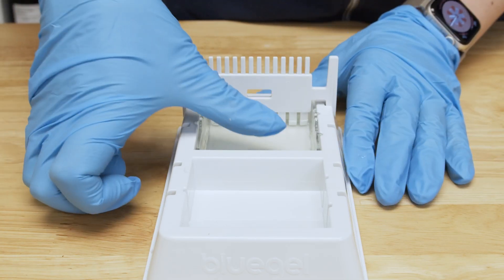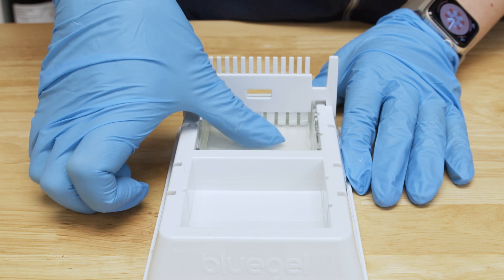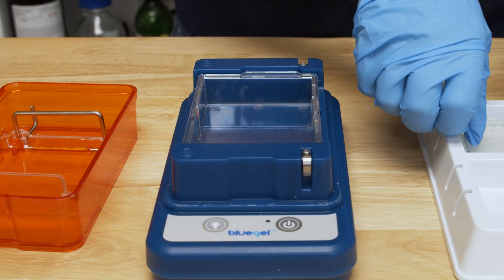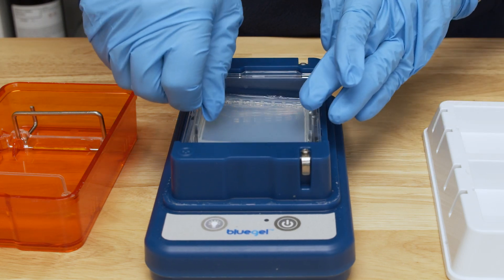The gel will set in about 10 minutes. Once cooled, it should feel firm like jello. Now you're ready to remove the combs and load your gel into your electrophoresis box. If you want to store your gels to run at a later time, you can prepare gels up to 5 days in advance. Wrap your prepared gels in plastic wrap or place them in an airtight container and store at room temperature, protected from light, for up to 5 days. Gels should not be stored submerged in buffer.